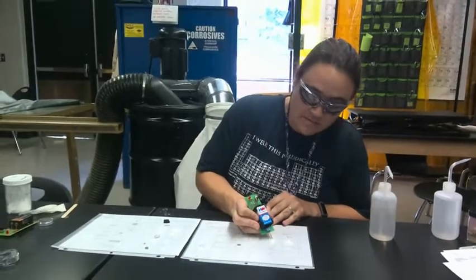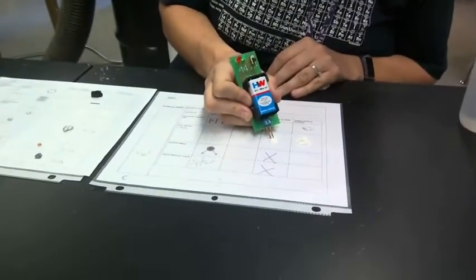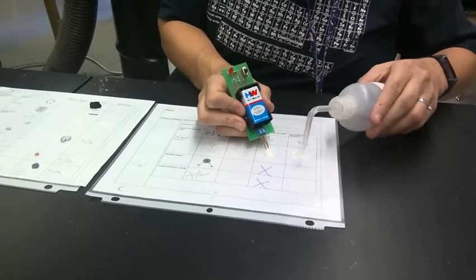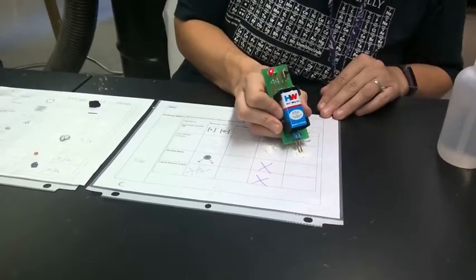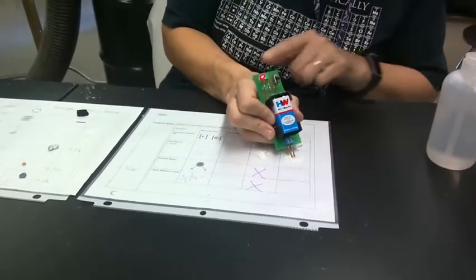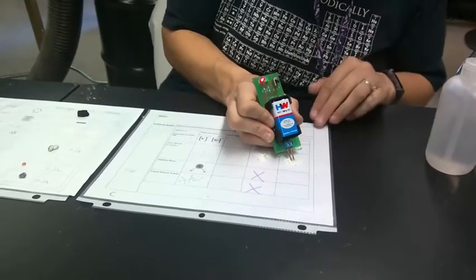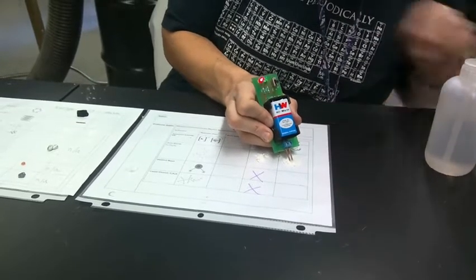So the next one is cornstarch. You can determine your conductivity. I will make my cornstarch solution. And you can determine that we do have one light lit up. The green one is off. So I would call this low to medium conductivity.